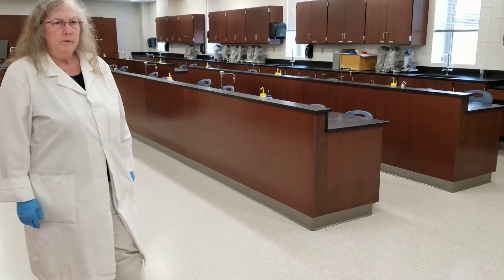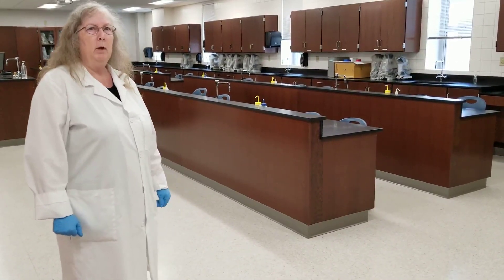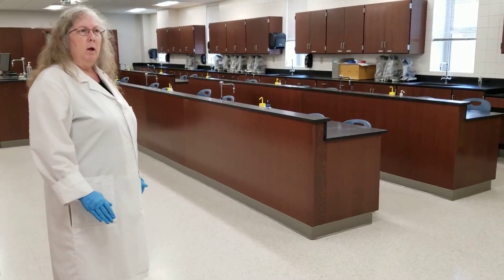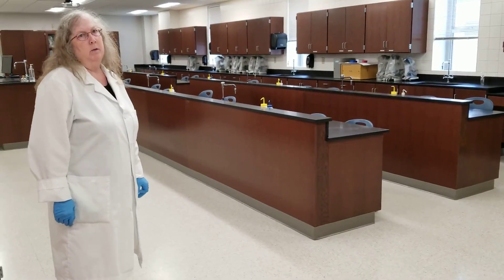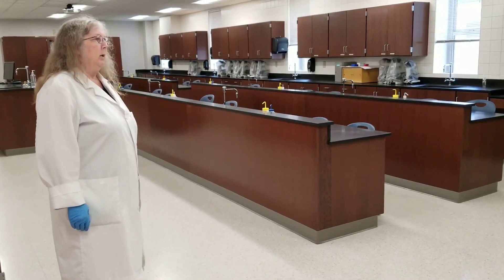This is the Microbiology Lab, so we're just going to go over some general safety things that we use here in Microbiology Lab. But a lot of these are standard for any type of science lab that you would be working with, and some of you may be familiar with this.